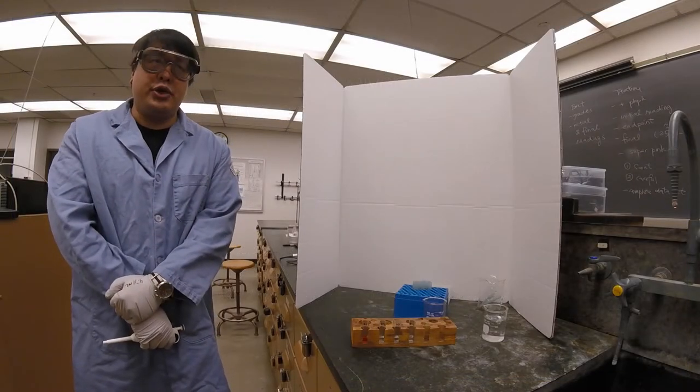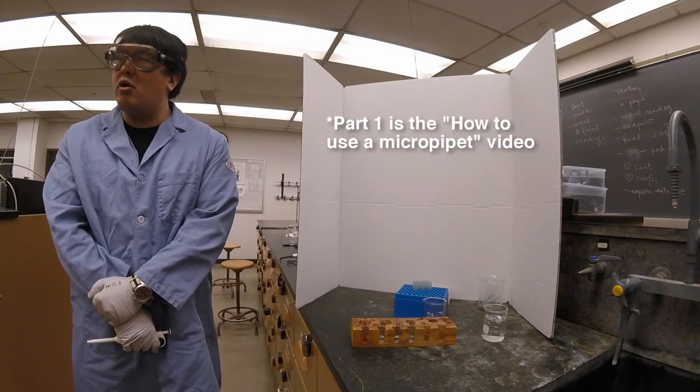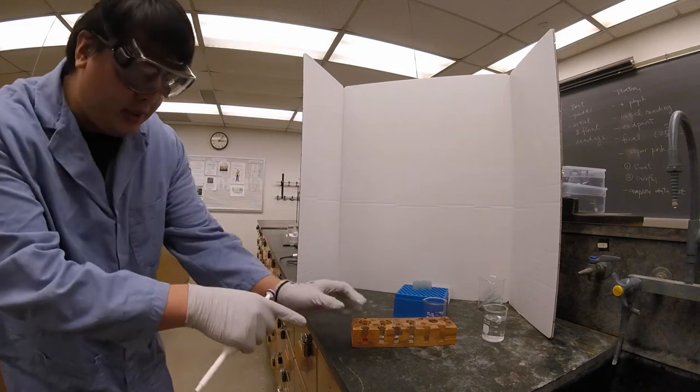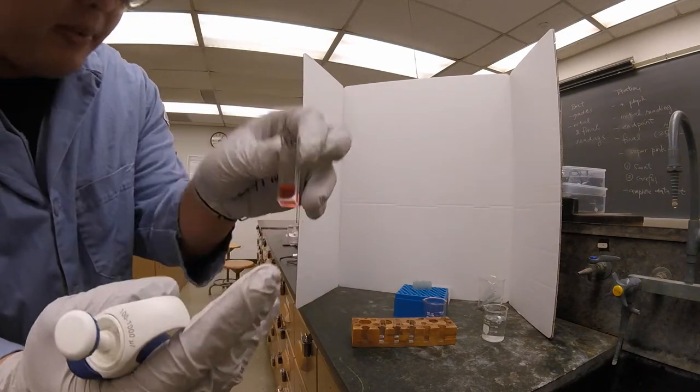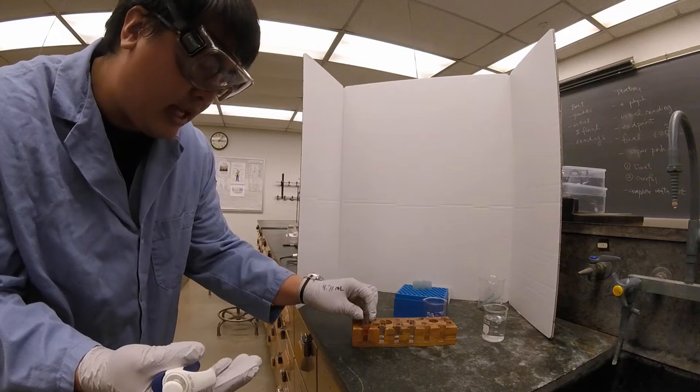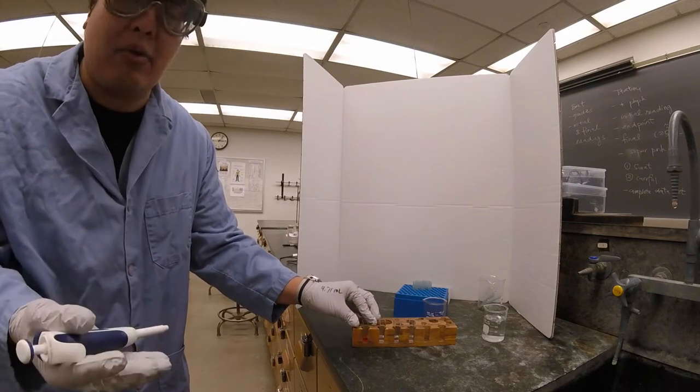In this video we're going to show you part two of R1 dilution. So we've already filled this cuvette with R1, as you can see, but we haven't diluted it yet and we're going to dilute it with water, DI water specifically.